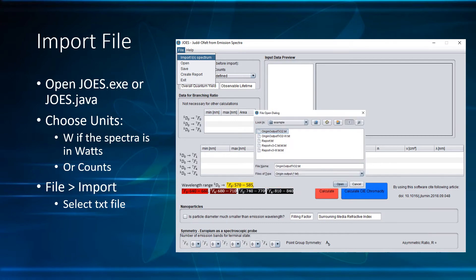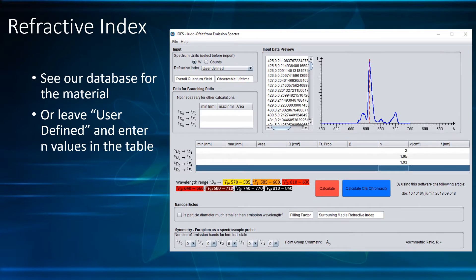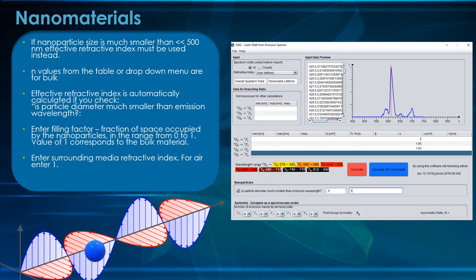The correct refractive index values are crucial. First see if your material is listed in our database with more than 150 different hosts. If that is not the case, enter the refractive index values for each transition in the table. The refractive index for the 5D0 to 7F6 transition is optional. If the spectrum is from nanoparticles that are much smaller than the wavelength of light, the correction to the refractive index must be used — it is enough to know the fraction of space the nanoparticles occupy.